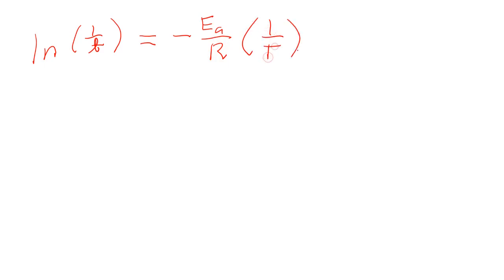So, you do need to record those temperatures, and then what we're going to do is make a plot of time versus temperature. And more specifically, we're going to make a plot of natural log of 1 over time versus 1 over temperature in Kelvin, because once we do that, we can use the slope of that plot to get our activation energy for the reaction.